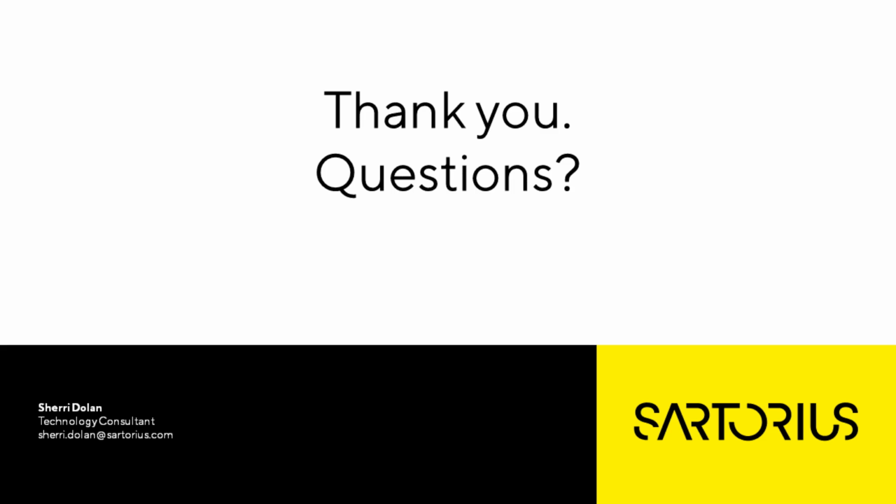Can these small scale devices be used in bind and elute mode? Yeah, it's a very common question. And yes, the small devices can be used in bind and elute mode.